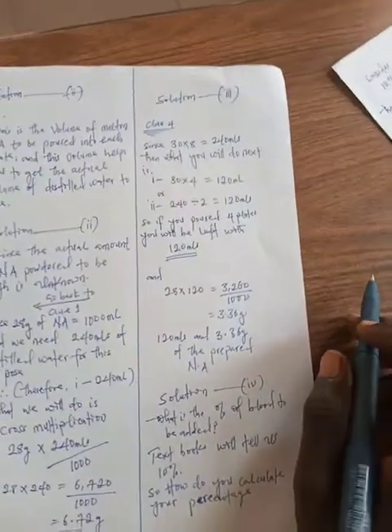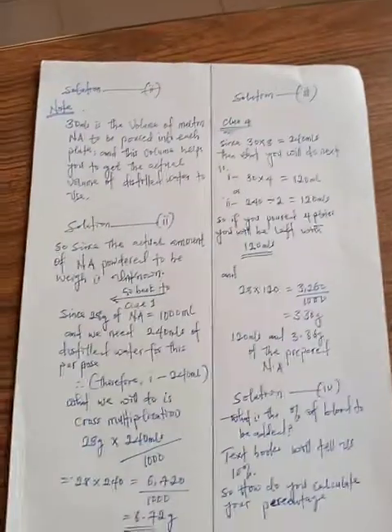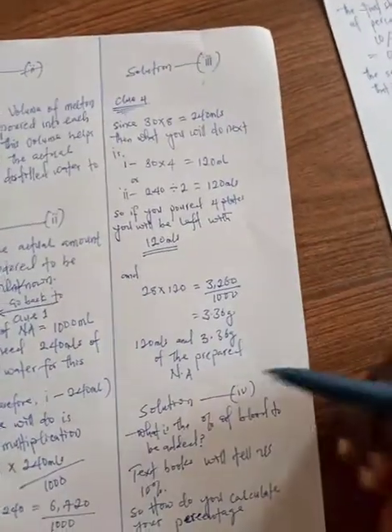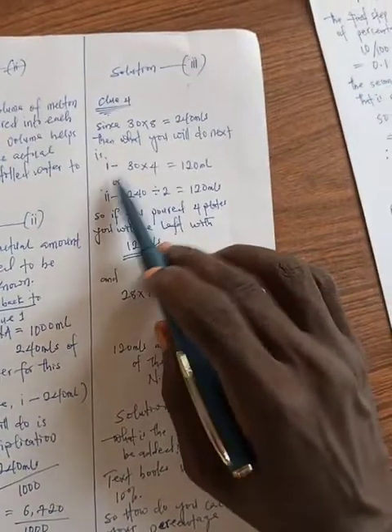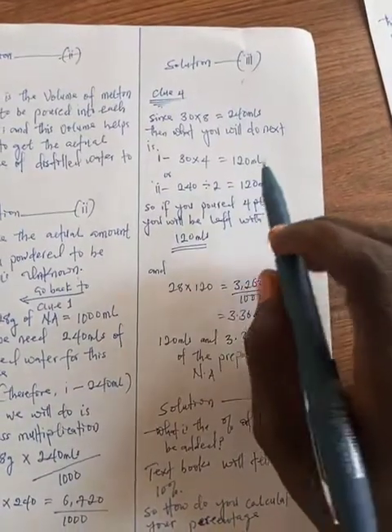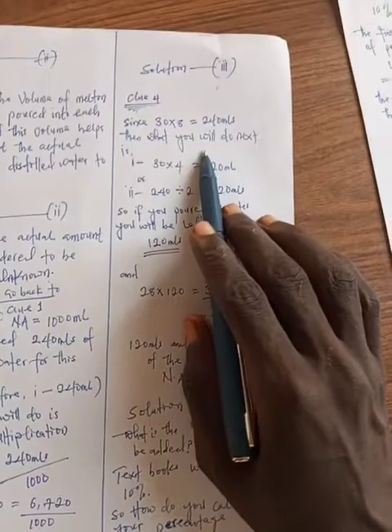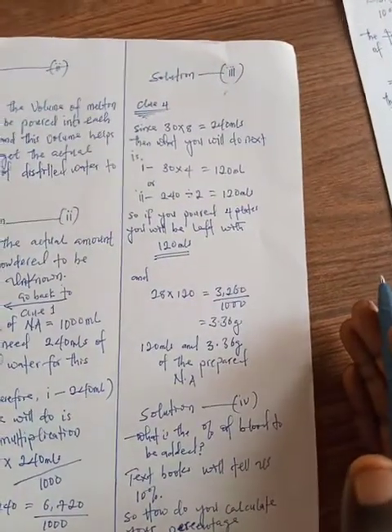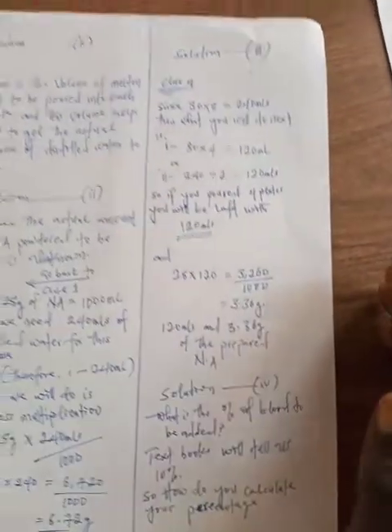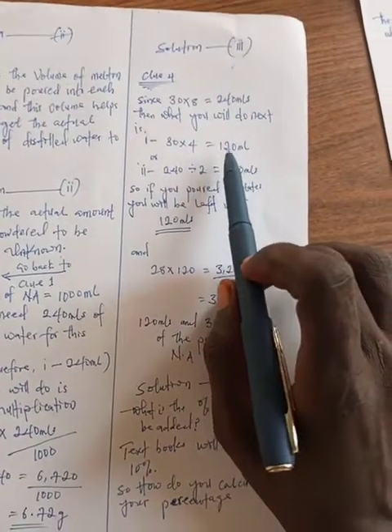We will have to go and get clue number 4. So question number 3 now says, the volume of nutrient agar to be used to prepare the blood agar. What is the volume of nutrient agar now to be used? So what you will say is, there are 2 things for you to do. You will either say 30 times 4, because when you pour 4 plates of the nutrient, you will be left with the rest of the molten nutrient agar, which you will use to prepare the blood agar. So you will say 30 times 4 is equal to 120.